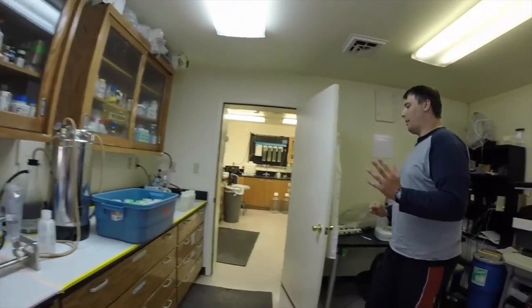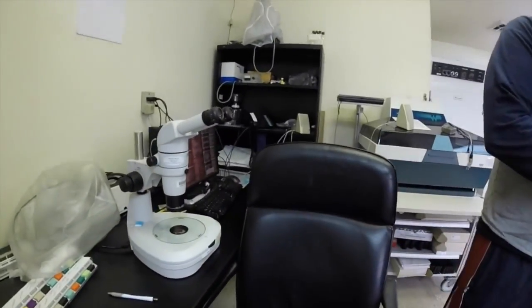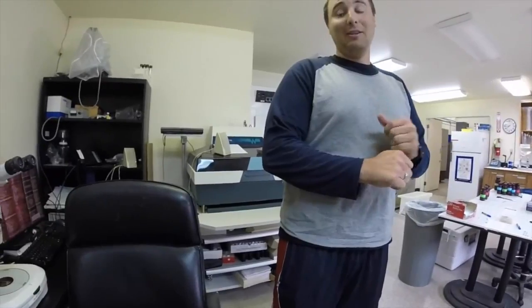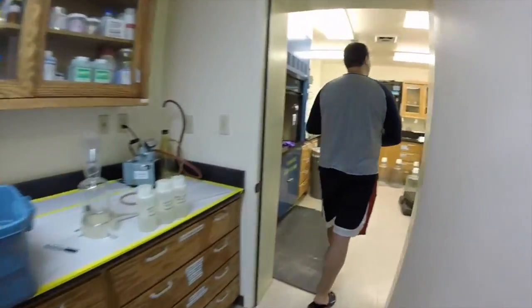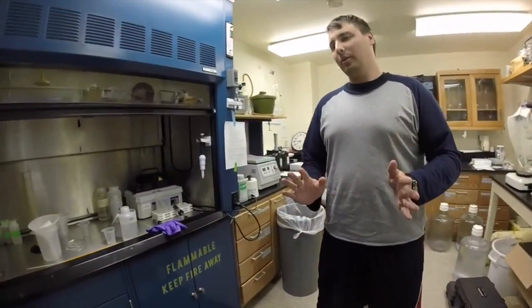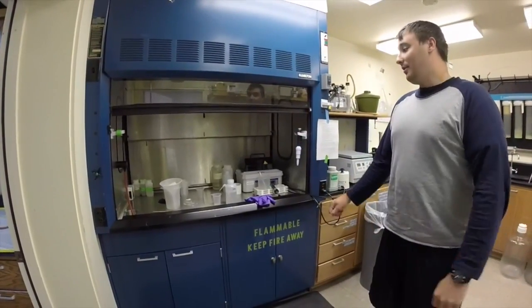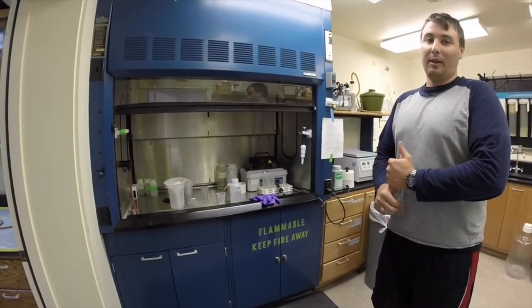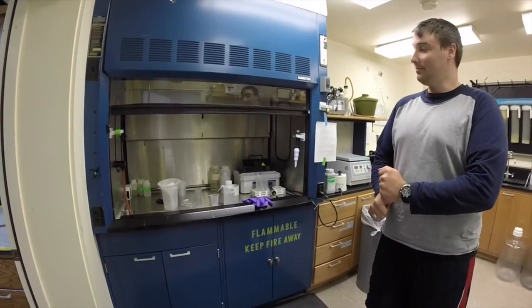This is our microscope that we use to count and analyze zooplankton samples. Right now I'm not doing anything with it, but that's what it's for. And then in here is our chemical hood — if we ever do any work with harmful chemicals, it has to be done within the hood for protection purposes. Every time we do zooplankton work we have to use the hood because it involves formalin. That's about all we do here.